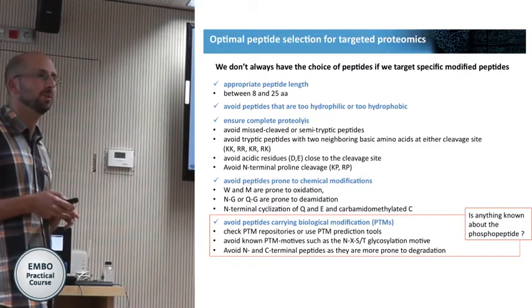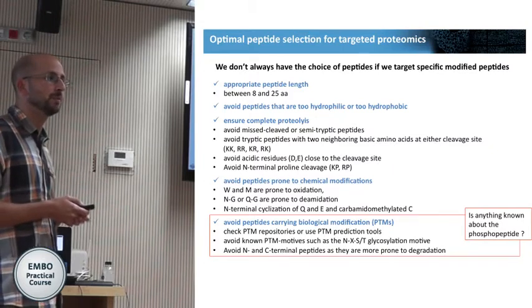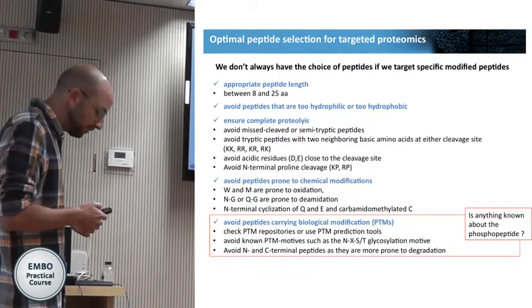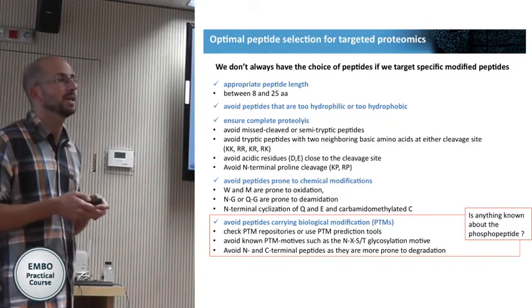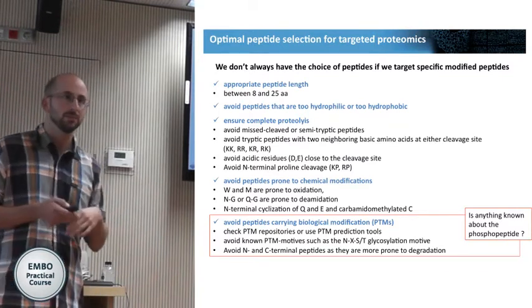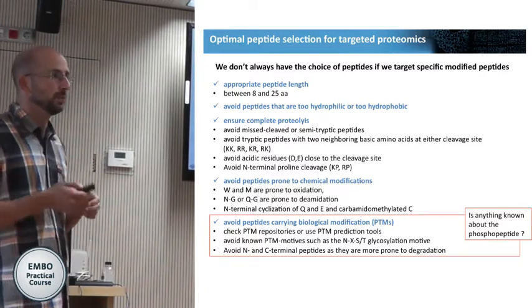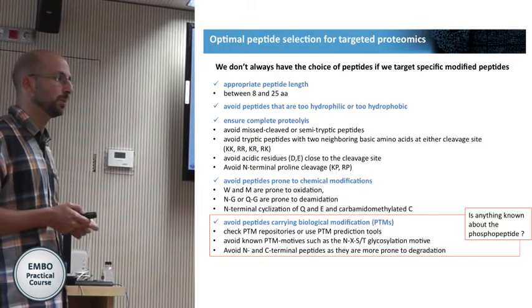When we were quantifying proteins, we could just dismiss this peptide, choose another one. When we're quantifying phosphopeptides, we need to take these things into account. Another very useful thing, once you've chosen your peptide of interest, is to also try and see, was this already previously seen by MSMS? There's all sorts of data repositories out there about previous studies from various groups, from large-scale phosphoproteomics.